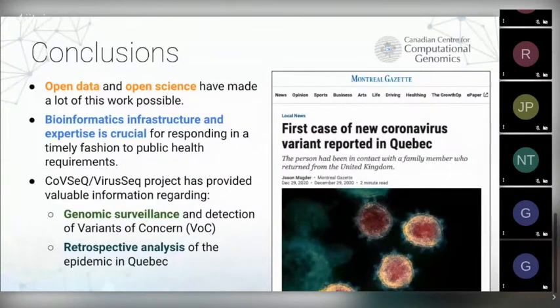So my first question is, but I think I have the answer. In NCBI, there is something called COVID CRCHUM pre-freeze. There's a bunch of Montreal COVID genomes, and they say Arctic as the assembly method. So is this yours?